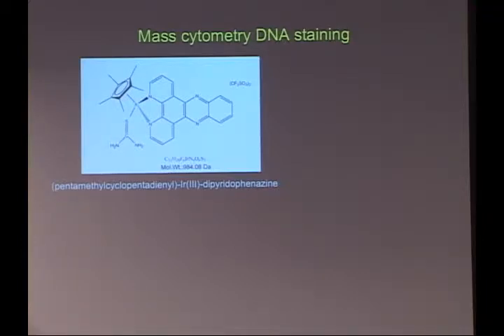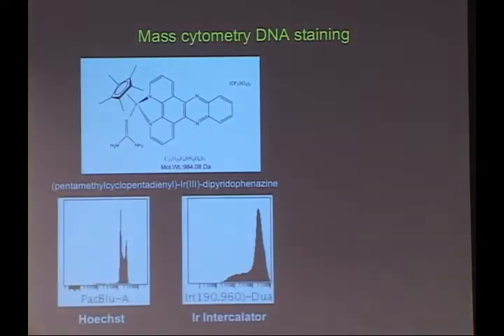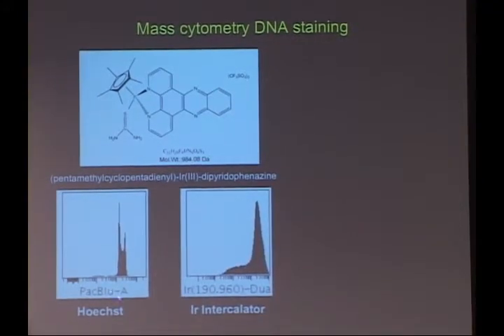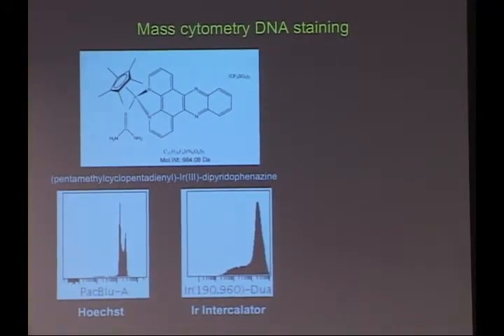And so the advantage with fluorescence is you only see the signal that's actually intercalated, because the spectral light absorbing and emitting properties of things like DAPI and Hoechst are different when they're intercalated as when they're not. But we don't have that advantage with the mass cytometer. And so as a result, if you compare the same cells by mass cytometry and this is Hoechst dye by flow cytometry, you can see with the flow you get this sort of nice two peaks with the S phase cells in between that you're all used to seeing, but by CyTOF you just get a single peak.